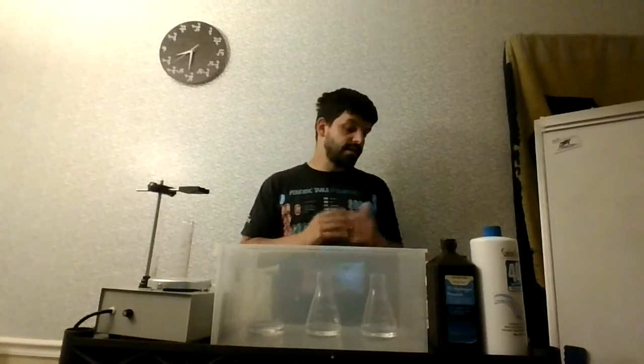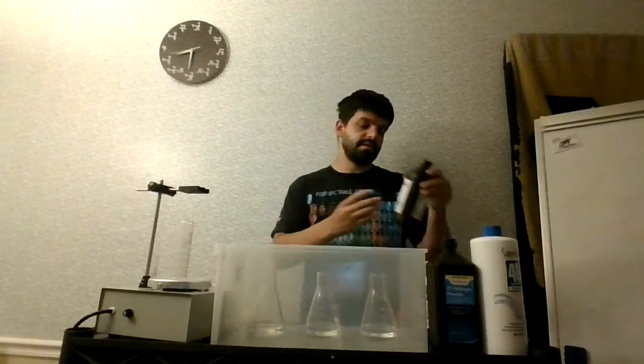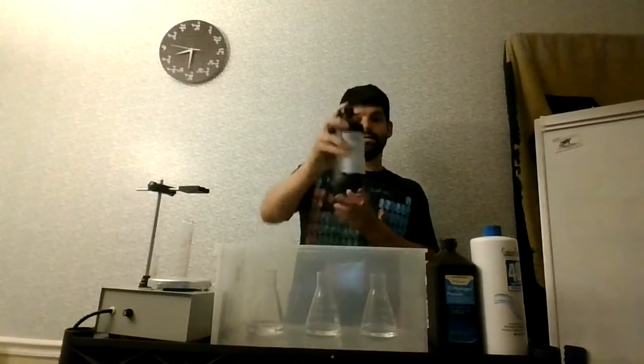active dry yeast. Then the other thing that we're going to be introducing in this experiment is another catalyst that we talk about, but this one is known as potassium iodide. It is another type of catalyst. Again, this stuff isn't very cheap, but it's really fun to introduce this aspect of the experiment and seeing how it differs from other catalysts like the yeast.